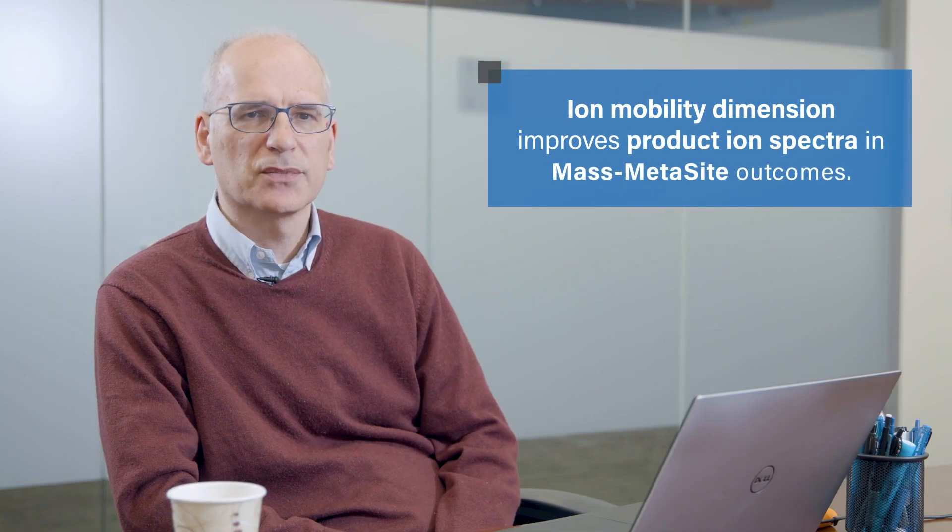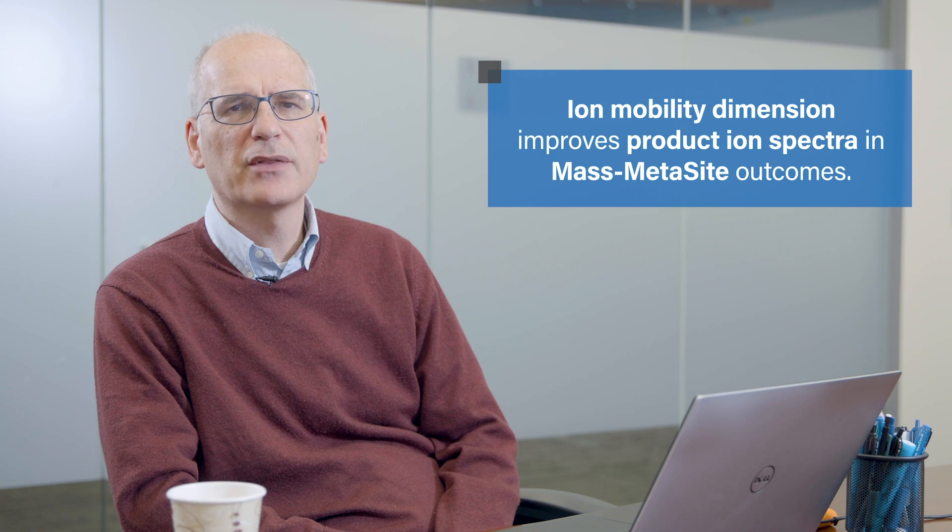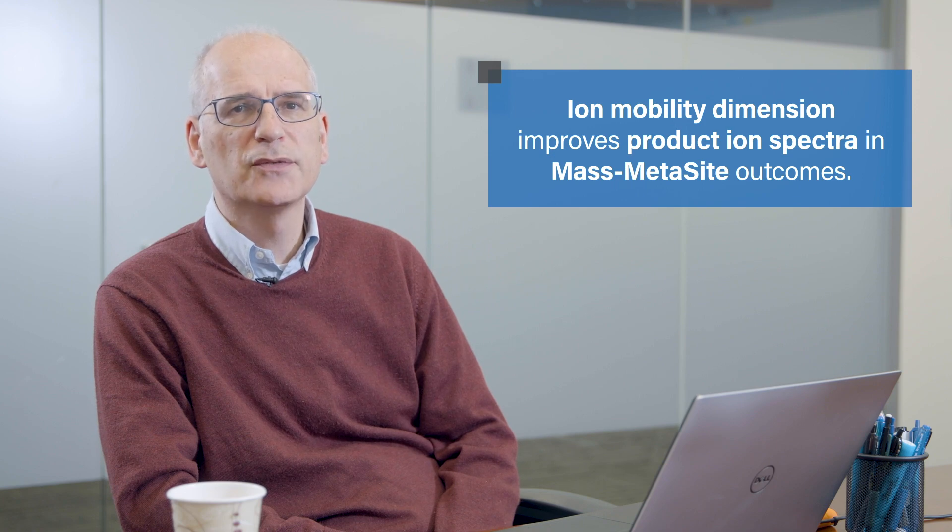Now let's look at a review of outcomes in Mass MetaSite and see how the ion mobility dimension improves product ion spectrum.